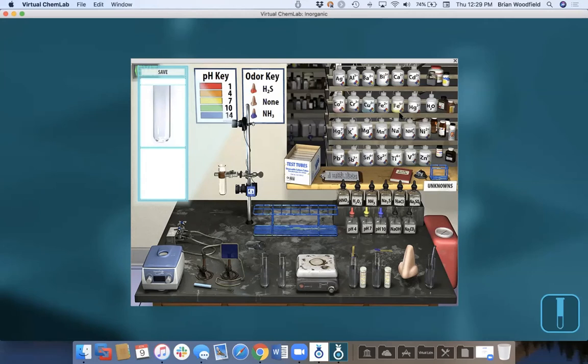So I only start with the ferric as the unknown. Having other possible cations can oxidize this up to ferric, and you can't distinguish between the two. Some of the smaller sets, we do include, and expect them to separate ferrous from ferric.